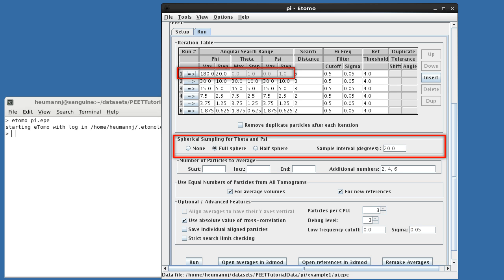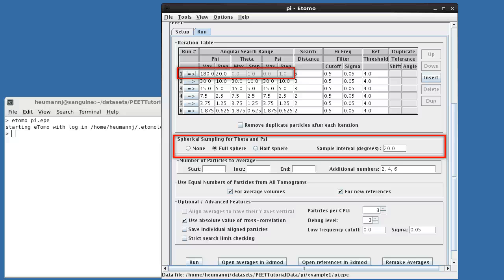Now consider the first iteration. Since we have no advance information about the particles' orientations in this example, we'll do a full spherical search. Since these data are noise-free and the particles distinctively shaped, we'll use an unreasonably coarse search step of 20 degrees. We could specify a max of 180 degrees for phi and 1 of theta and psi, with 90 degrees for the other, and a search step of 20 degrees for each. That would work, but would result in a highly inefficient search.